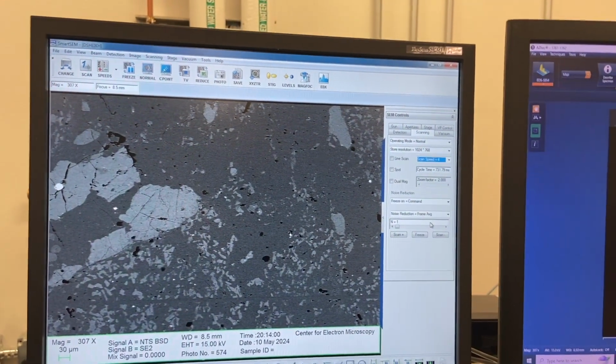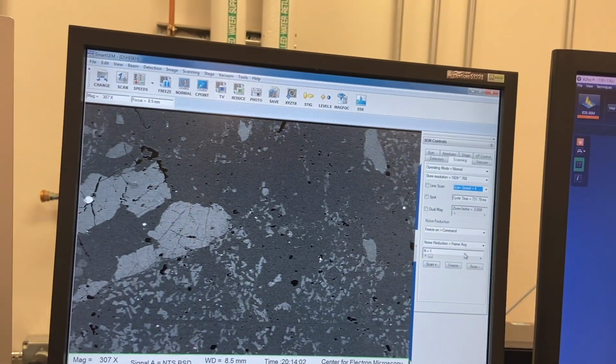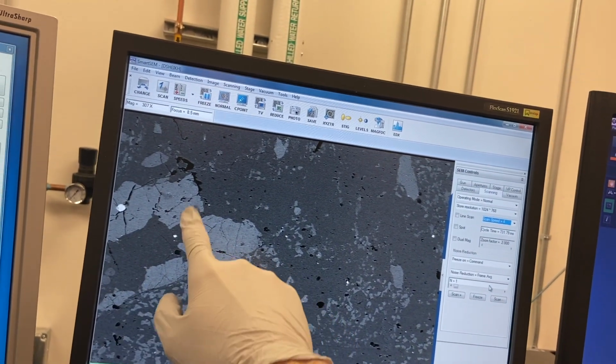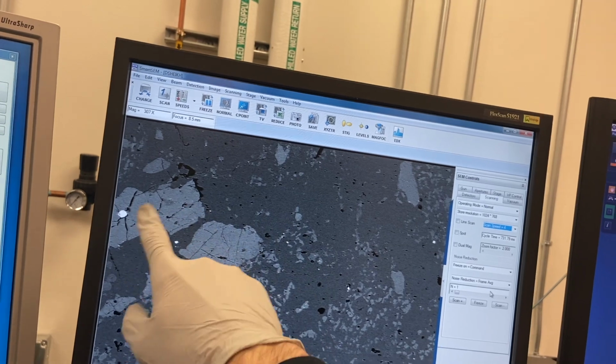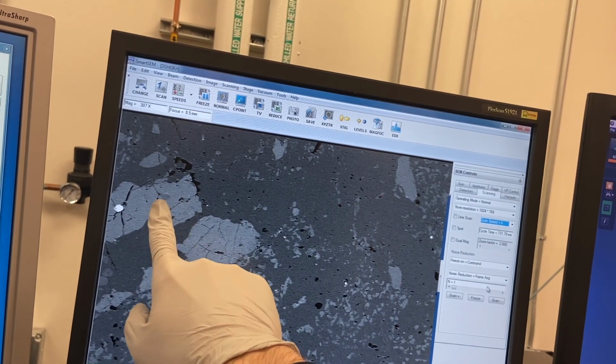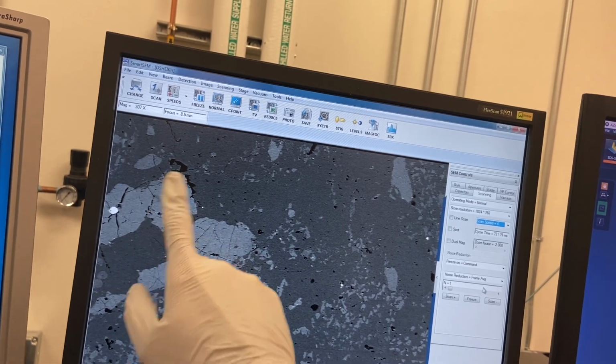So yeah, it does look like we took a troctolite, right? That actually looks like a troctolite right here, right? That looks like olivine, very fractured. There's a blocky feldspar. Maybe that's chromite. I mean, sulfide. Maybe there's melt inclusions on olivine, right? Typical with Mg suite material.